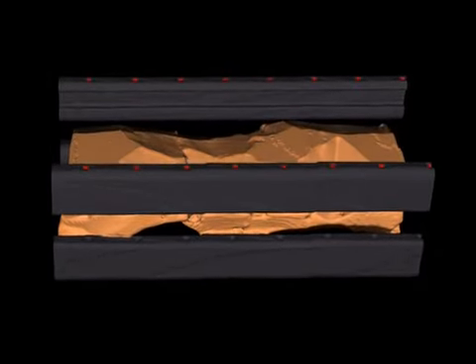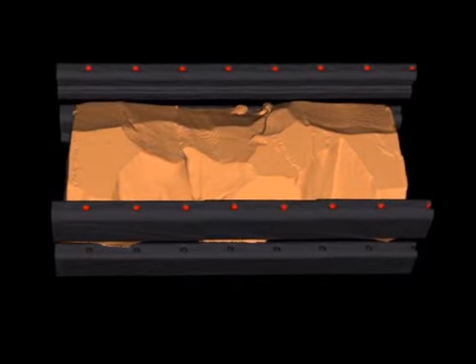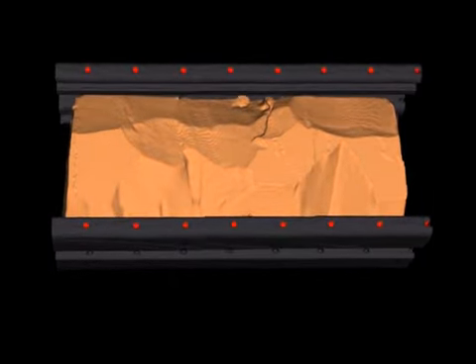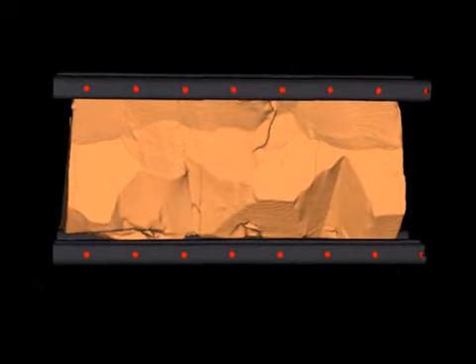To test that the fusion works properly, we used an agarose phantom. Some titanium oxide powder was added for scattering. To realize an irregular shape, we cut away some parts. Several small inclusions filled with fluorescence and CT contrast agent were built into the phantom.